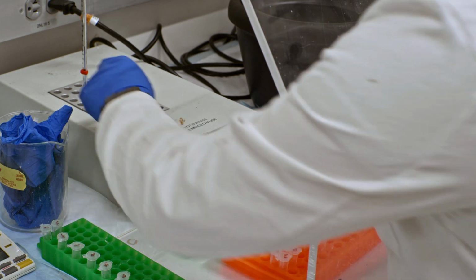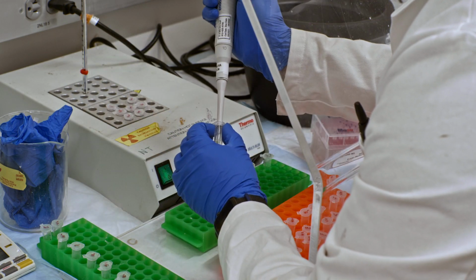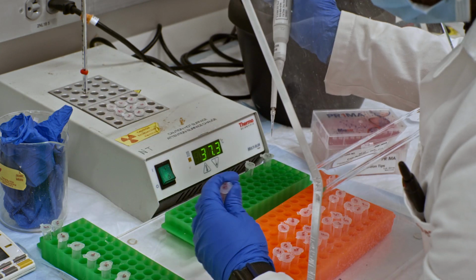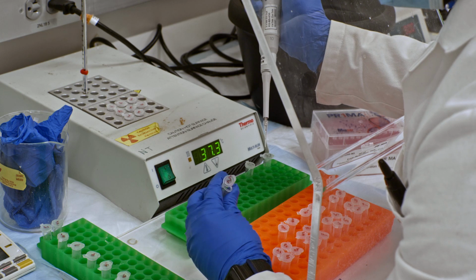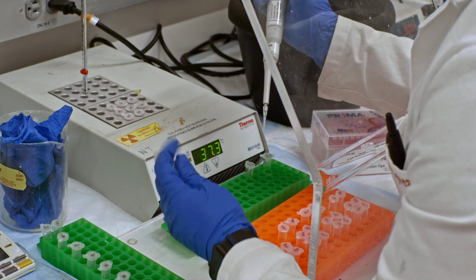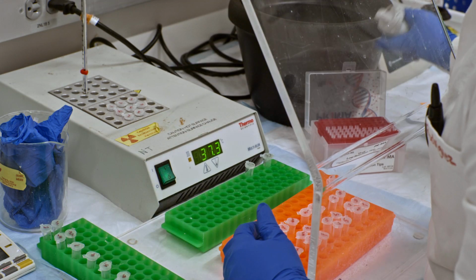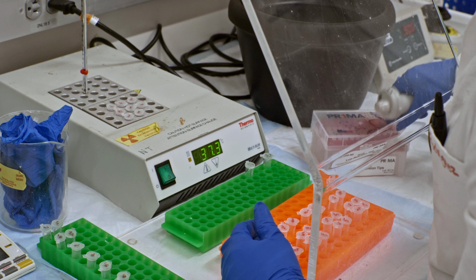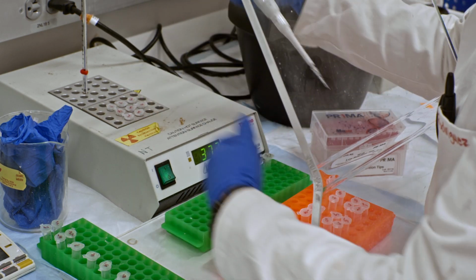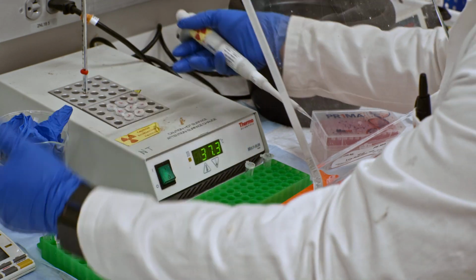And then, since I'm repeating it every 30 seconds, get my sample from reaction vessel 2, go to my 5-minute time point for reaction vessel 2, and add. Close, and get rid of my pipette tip. And get ready for the next time point to get, which is from 3. And this will keep repeating itself over and over again, 5 minutes, then at 15 minutes, then at 30 minutes.